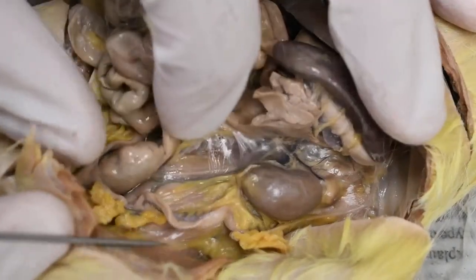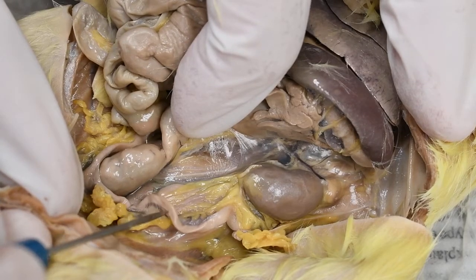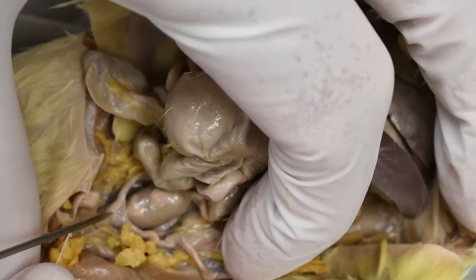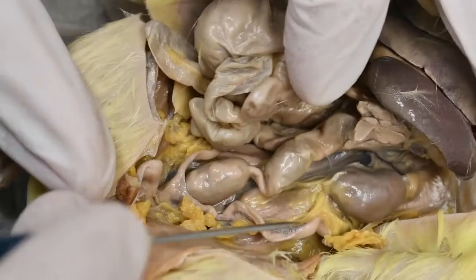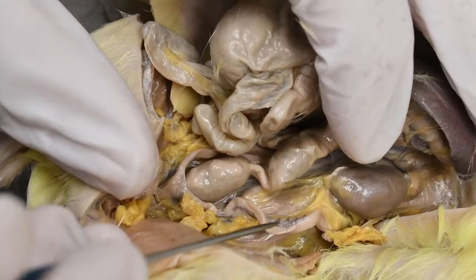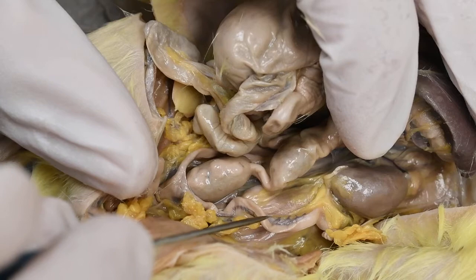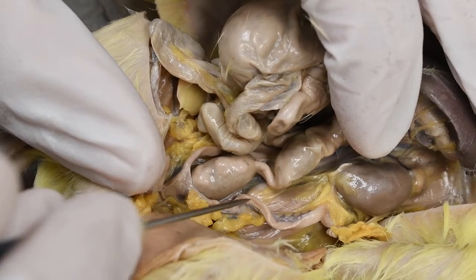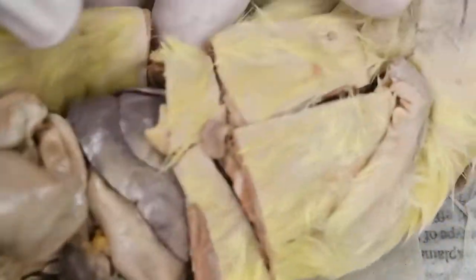All right, so let's see. This specimen is actually a female. And you may notice there's a tube here. That's an oviduct. The two oviducts come down to a common area here, which we could call the uterus. In something like a rat, the embryos actually start developing in the oviduct. Sometimes we will dissect one that's pregnant, and she'll have multiple embryos along the oviduct. Okay, let's see what else we want to talk about.